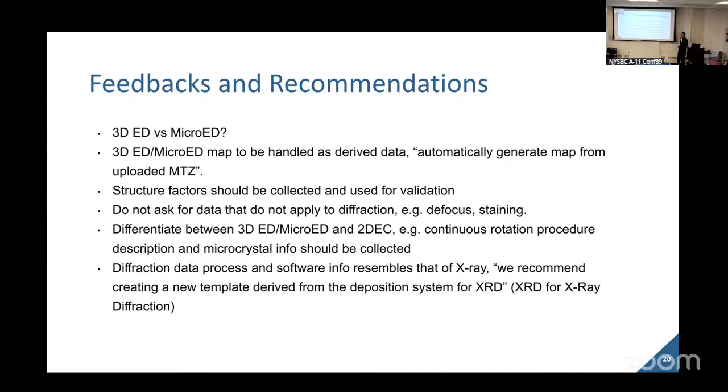They really don't like us to focus on the map because the map is derivative. Several people say the map should be automatically generated from the uploaded structure factor. MTZ means the structure factor MTZ.